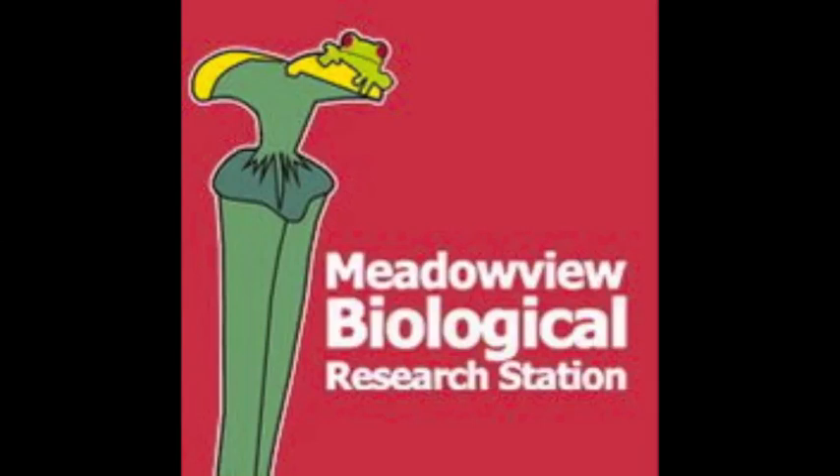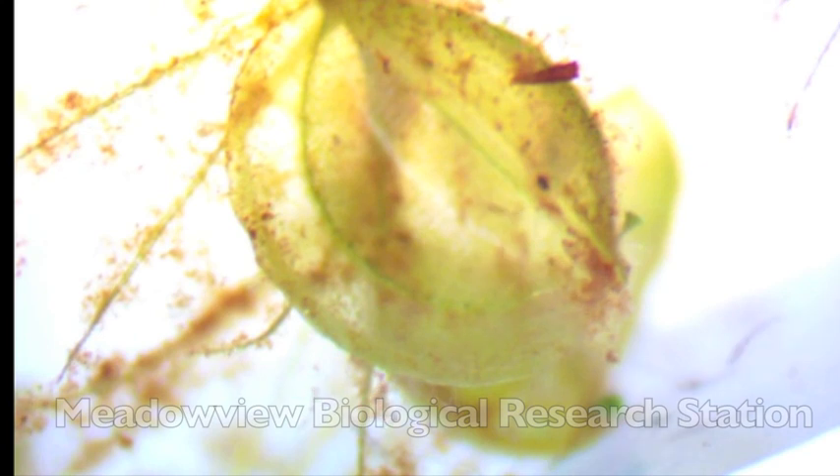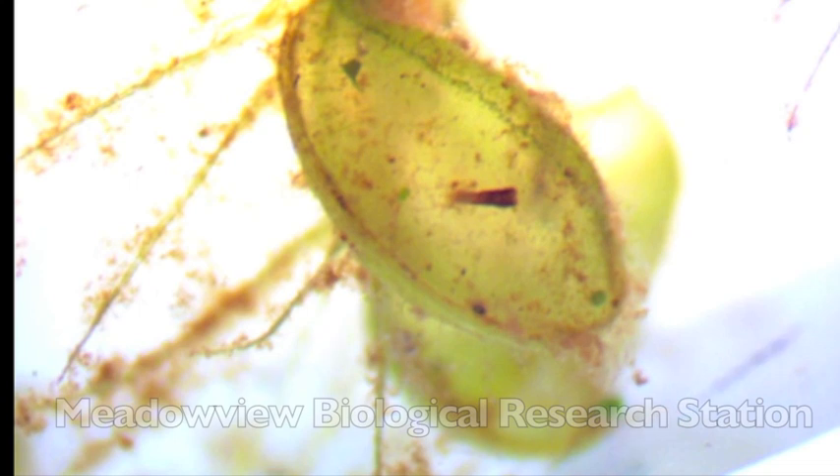Hi and welcome to Meadowview TV. Today we're taking a microscopic look at Aldrovanda vesiculosa, the underwater flytrap. Did you see that? The trap just snapped shut.